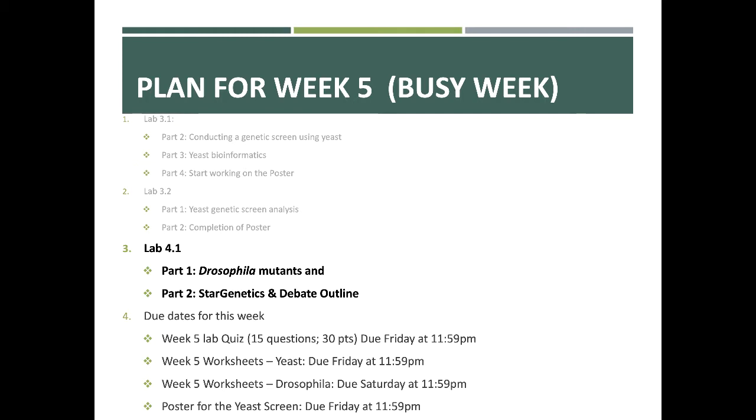Lab 4.1 here, we're going to start working with Drosophila, as I said before, and we're going to spend a little time talking about Drosophila mutants, and there's going to be a little activity that you have to complete with the mutants. And then there is a genetic cross simulation that you will do using a program called Star Genetics. Don't forget your due dates shown down here. Everything is due either Friday or Saturday. The worksheets that we're going to be talking about today will be due on Saturday at 11:59 p.m.